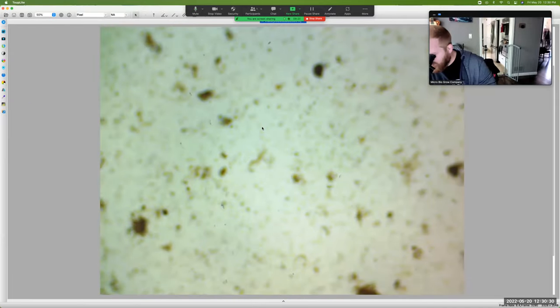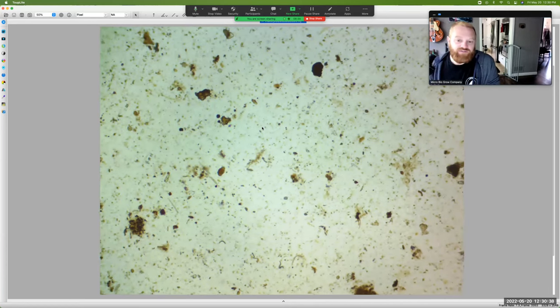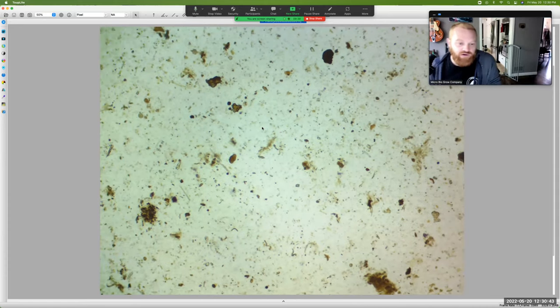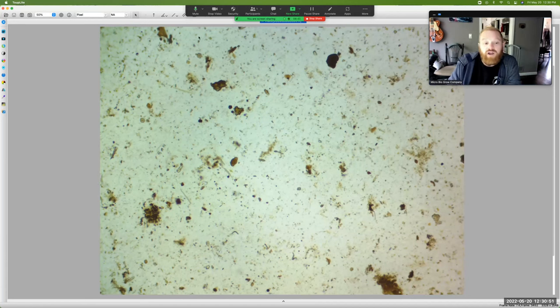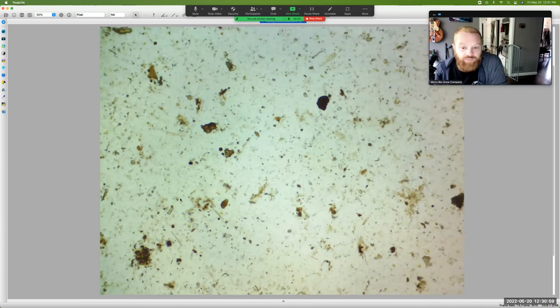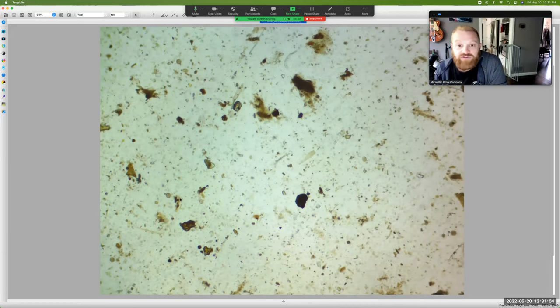We can even zoom out further. As you can see here we've got all sorts of nematodes, which is what you want to see — that's exciting stuff. You see one moving there. There's another one over here, there's one here, there's one here — the other two were up where we just moved down from. We've got them all over the place, and that is fantastic.